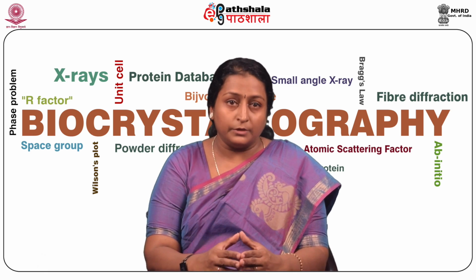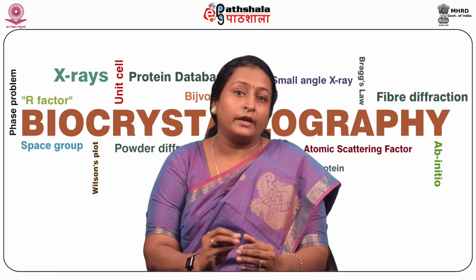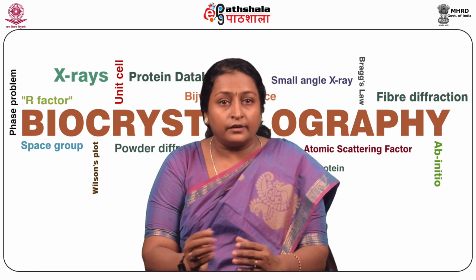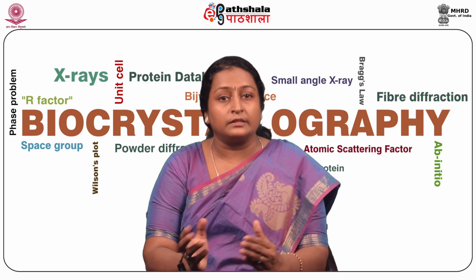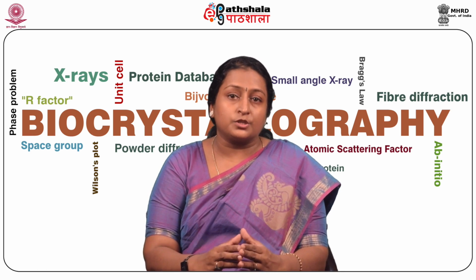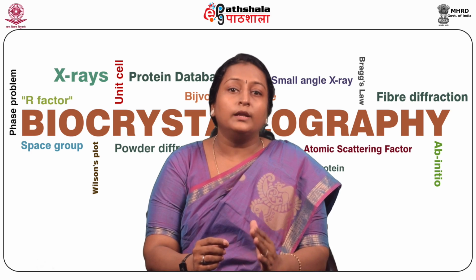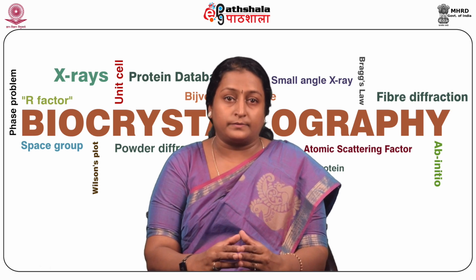Moving on to the limitations, homogeneous and single phase material is best for identification of an unknown, which is a bit difficult to attain. We must have access to a standard reference file of the inorganic compounds, which stores the d-spacings and the HKLs as standards. For unit cell determinations, indexing of patterns for non-isometric crystal systems is much more complicated. Peak overlap may occur, and it will again worsen for high angle reflections.